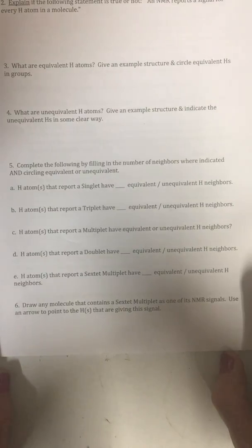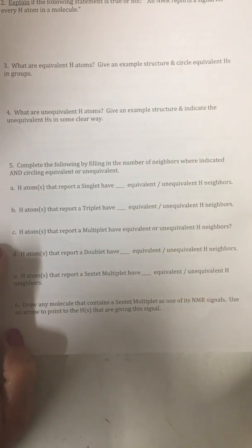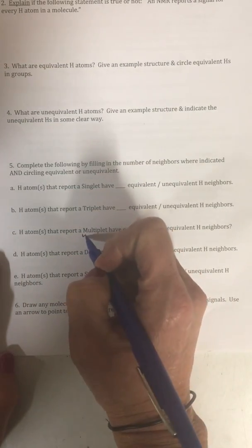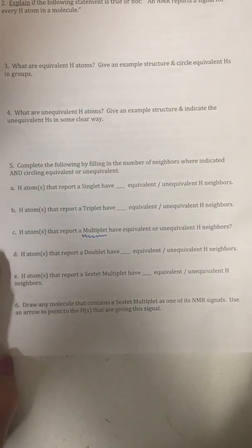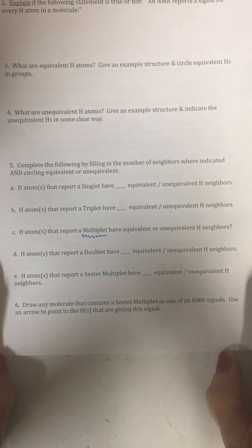Okay, so a triplet, you have 2 equivalent neighbors. 2 plus 1 gives you 3. C, it says hydrogen atoms that report a multiplet. So something that's always going to be sort of hinted at you, and I always label it on a spectrum, are any multiplets. Now multiplets can be kind of messy looking signals. They're not clear at all. Sometimes they are pretty clear.